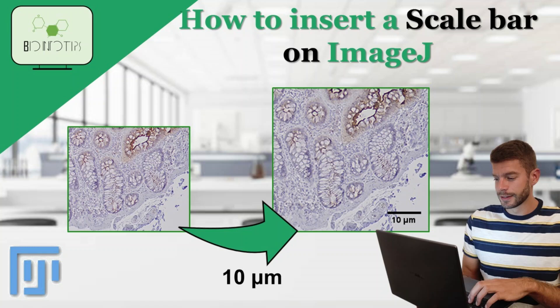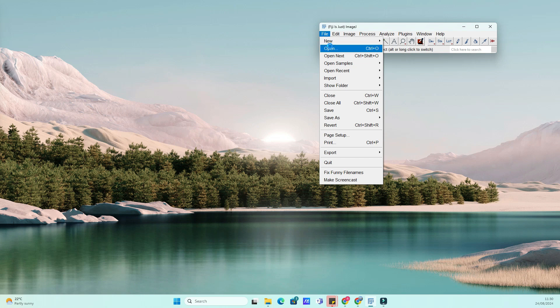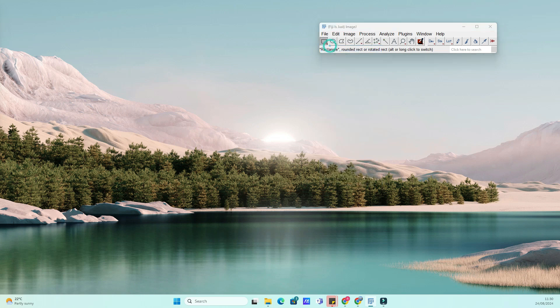Do you want to know how to insert a scale bar on ImageJ? You came to the right place. Hey everyone, welcome back to BioInfo Tips. In today's video, I'm going to show you how to insert a scale bar into an image using ImageJ.